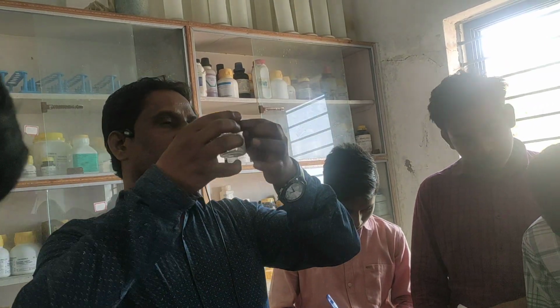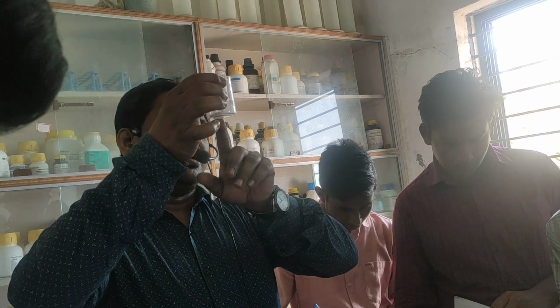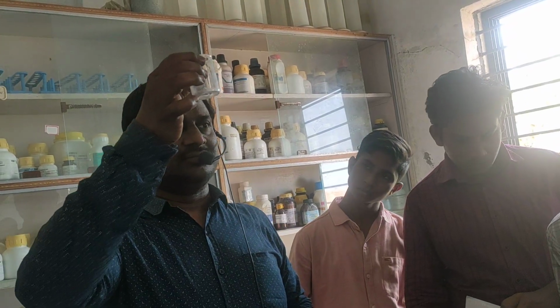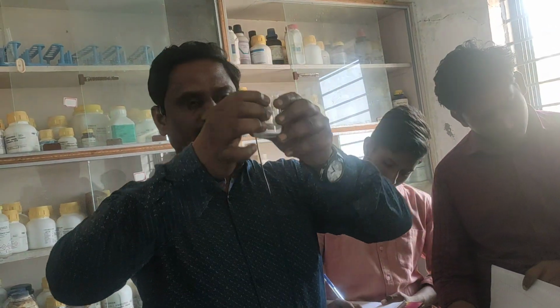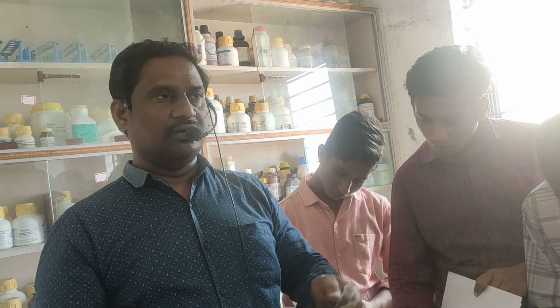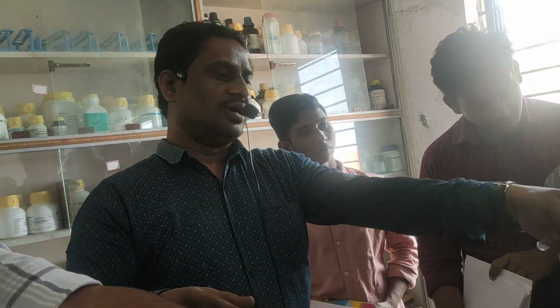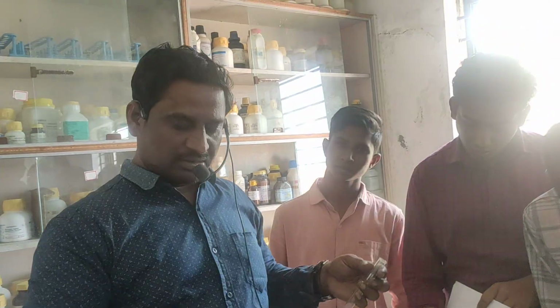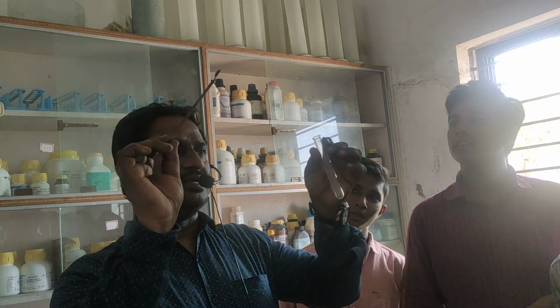Solubility test. Yesterday I told you, crystalline salts are soluble in water, and amorphous salts are soluble in dilute HCl. Now I will show you by taking the solubility test. Give the distilled water bottle, a full water bottle. Now look here. This is called a spatula.